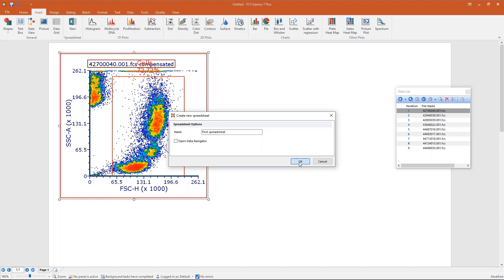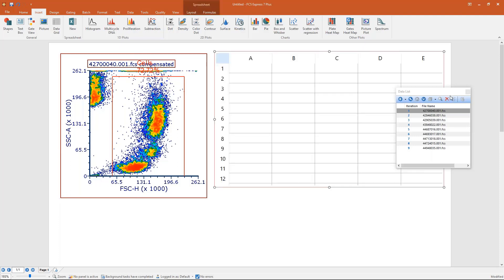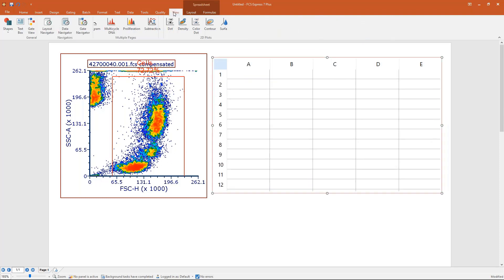The spreadsheet looks just like Excel — different columns, different rows. You can open multiple spreadsheets and keep track of all of them in your layout by opening the Data Navigator, found in the View tab. The Data Navigator lists all datasets. In this case, I have a first dataset which is an FCS file open in this plot, and a second dataset which is my spreadsheet object.